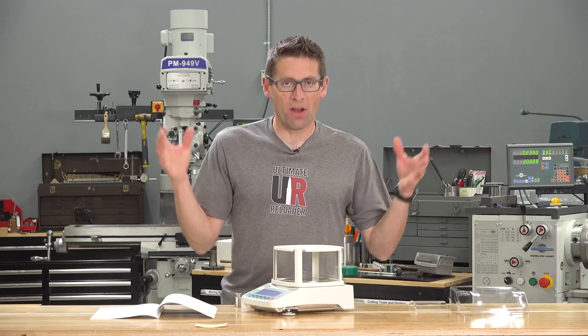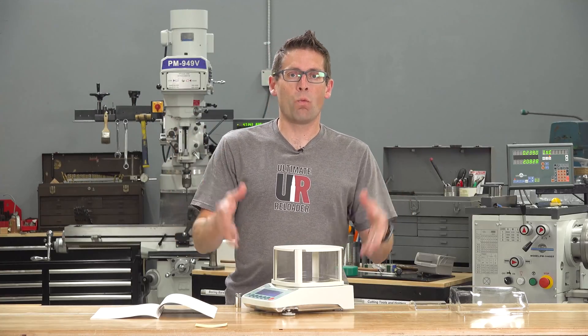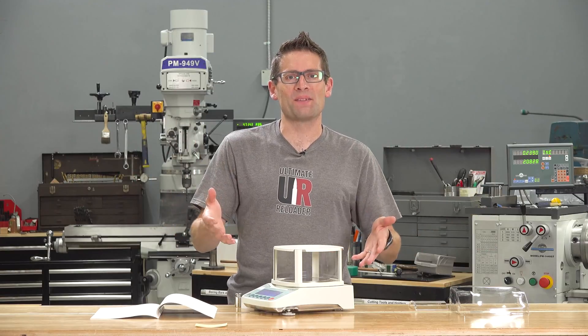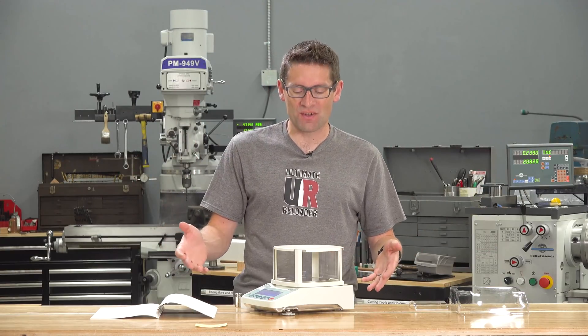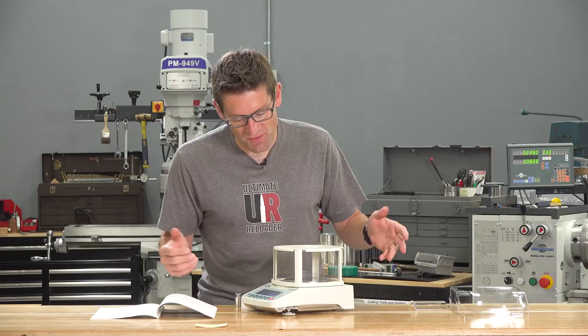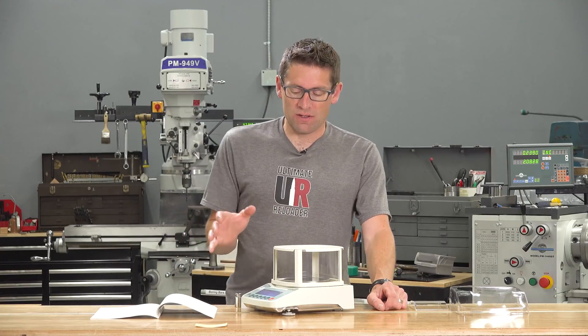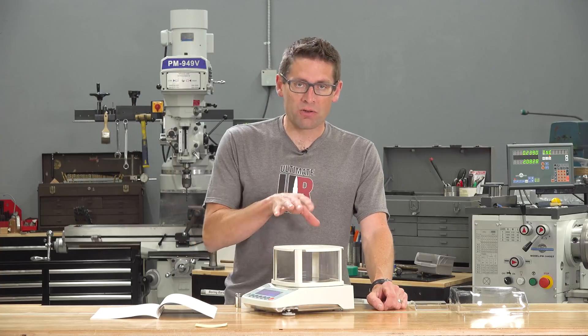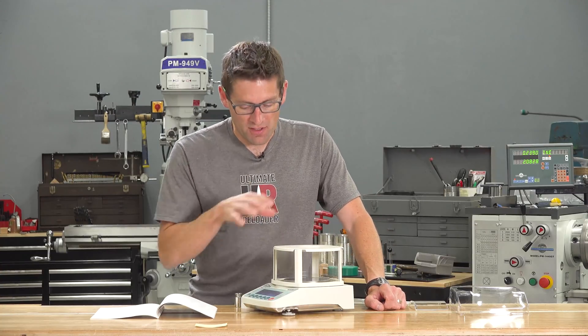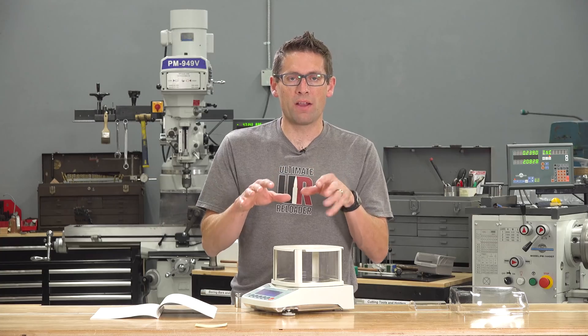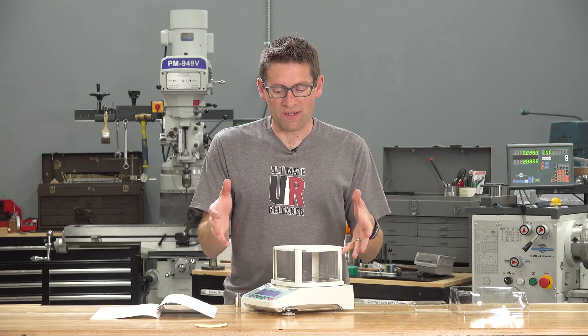So I've had this scale plugged in and it's been on for at least a half an hour. That means it's warmed up and ready to calibrate. Actually, it's not really a scale, it's technically a balance. But we all call these scales in the precision reloading world, so I will use that terminology. Now we can calibrate and there's two ways that we can do this. We can use the internal calibration routine, which is just to take everything off the pan and then to hit the Cal button.